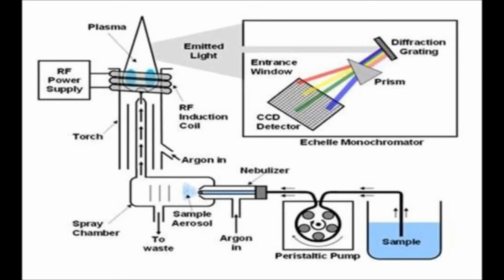And then what we do is, with the monochromator, we just look at emission of light from the plasma. With the monochromator and a detector, we can detect specific wavelengths. So remember, the wavelengths of emission are going to be determined by the electronic states available for the elements, and the emission of lead is very different than the emission of, say, magnesium, the emission of sulfur, or any other metals or compounds or any other elements that might be in your sample.